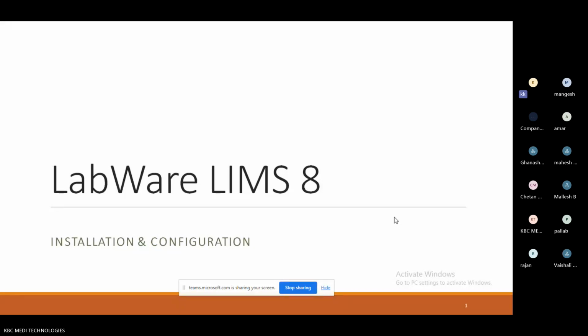And instrument interfaces. Different types of instrument interfaces will be there. One is the balance interface, second one is standalone systems. Okay, if you need an idea about the Empower interface, I'm not going to cover that topic during these sessions. That will be a separate discussion.